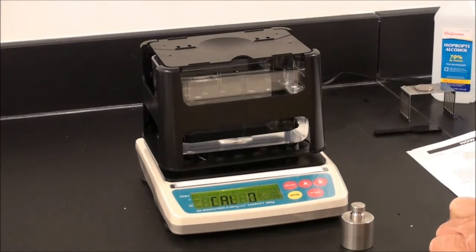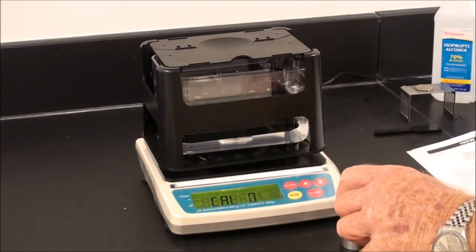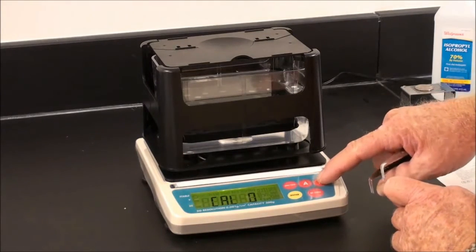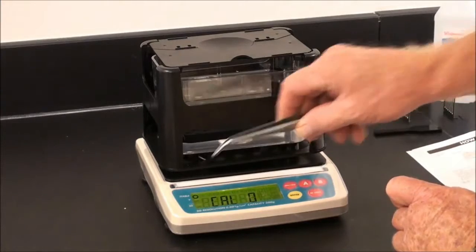Now you see CAL 0. Press the B key, the stability mark will appear.